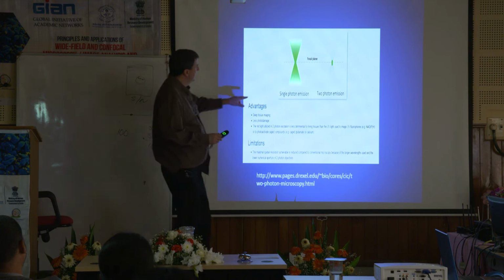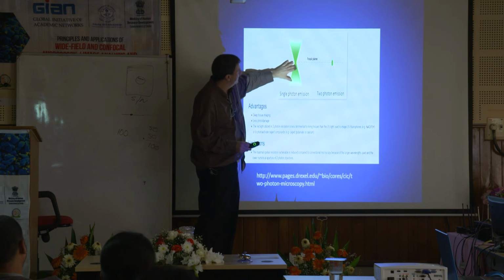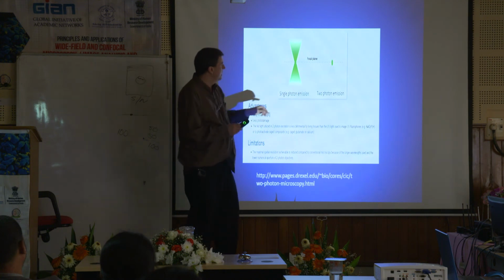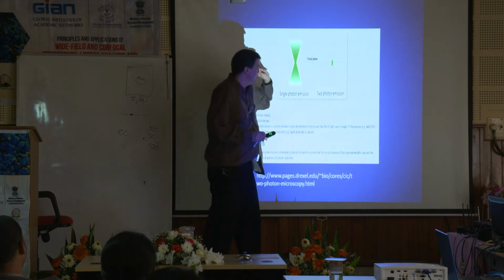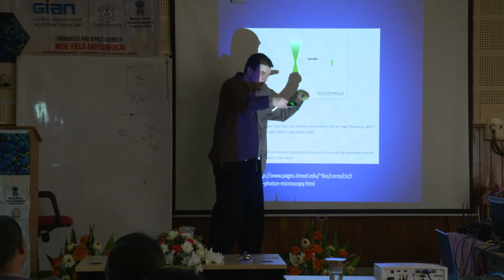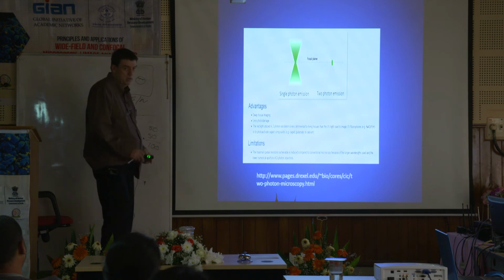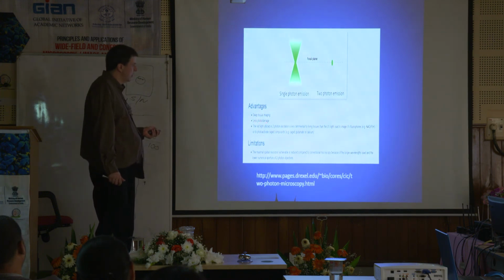And here's the way to look at it: with single photon, the laser light's coming in, and it's going to excite some of this stuff, and then you're going to use the pinhole to just get what's in focus, right? But here, you're only going to excite right here. So you're not going to excite any of this stuff at all. The fluorescence won't fluoresce. But on a regular confocal, it will excite here, and it will excite here. But you're using the pinhole to grab it out. Here, only where those 2 photons come up with the right energy will it work. Okay? That's the difference. Of course, advantage, deep tissue. Other advantage, less photo damage. You're using a longer wavelength, less energy.